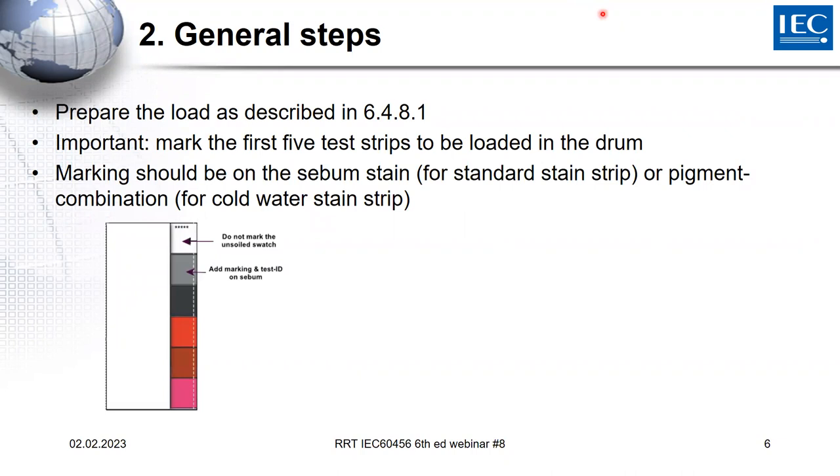Coming to the general steps, there is actually nothing new in the normal procedure. The only difference is in the preparation of the load. That's a new fact. This is also important to know. For the LAS rinsing performance, we take the unsoiled swatch of the stain strip. And it's very important that you do not mark anything on this stain strip with a pen, because we cannot guarantee that this does not influence the measurement of the LAS rinsing performance. That's why mark everything on the sebum. It's still readable afterwards, no problem.